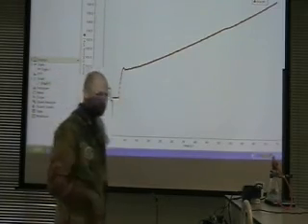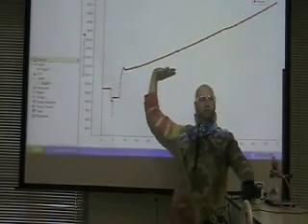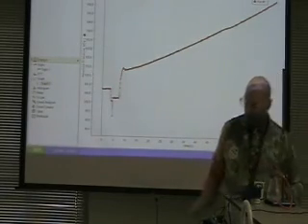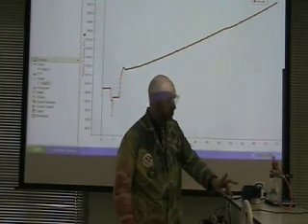And then you can manipulate conditions to make the slope higher, faster, slower, lower and slower, whatever you like. Okay? So that's a pretty good way to do things. Any questions on that one before I move on to the next one? Got 2 more. All right.